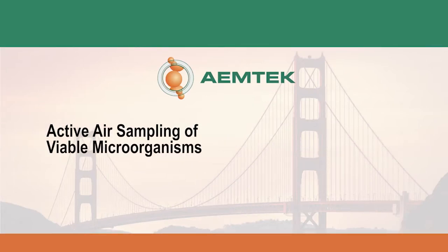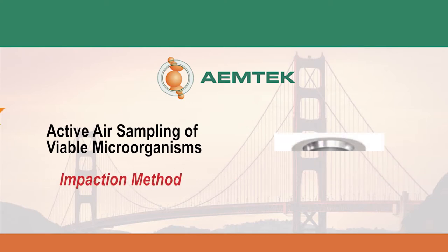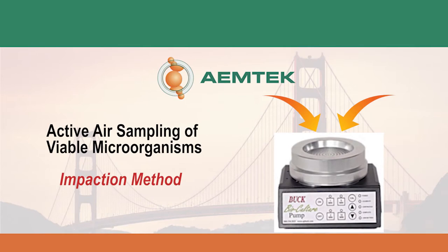This video will demonstrate how to perform active air sampling using the impaction method. This method separates particles from the airstream using a pump to force the deposition onto a solid surface.